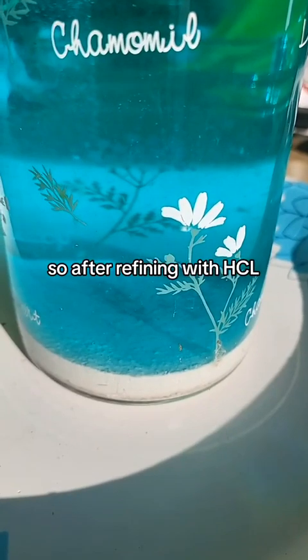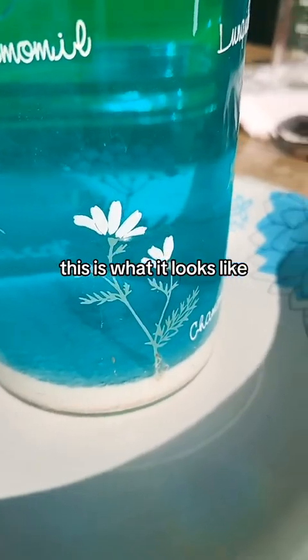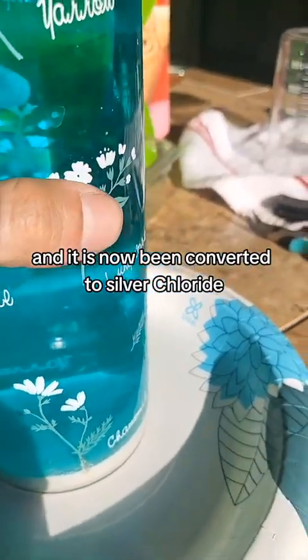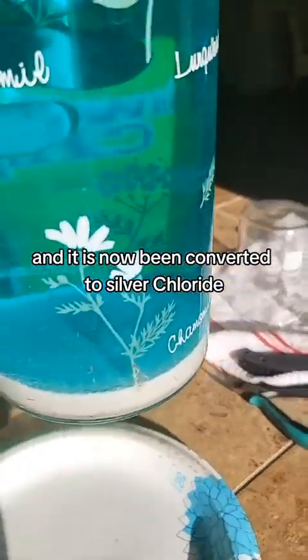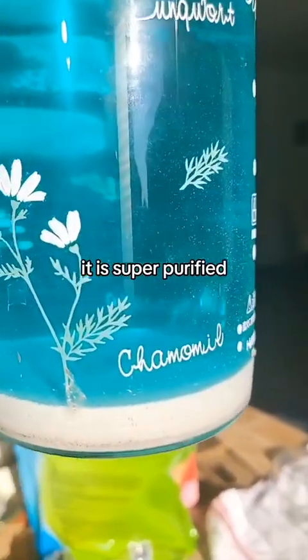After refining with HCl, this is what it looks like. It has now been converted to silver chloride. It is super purified.